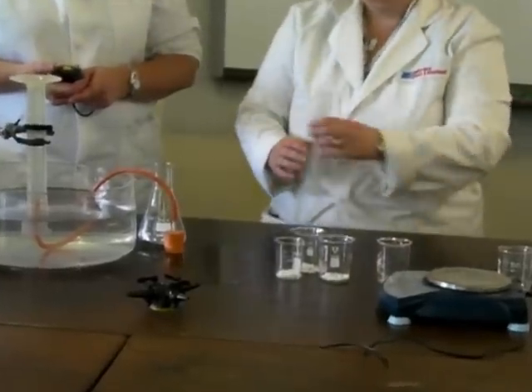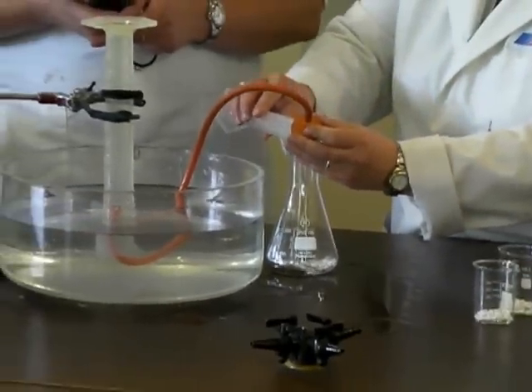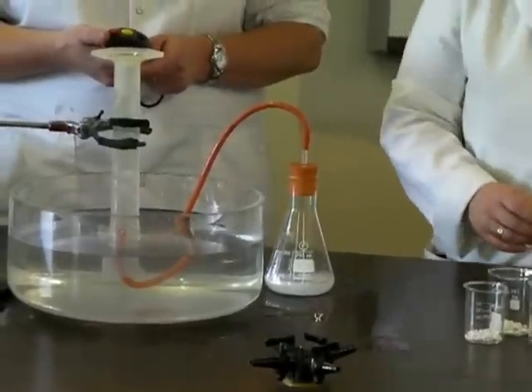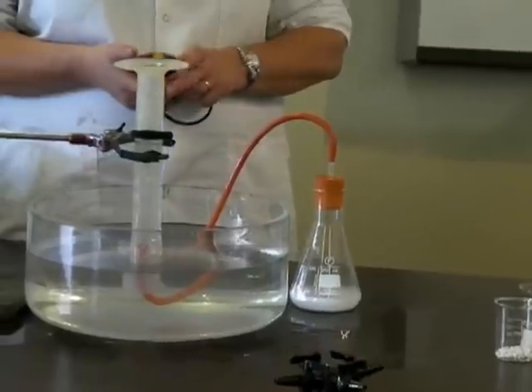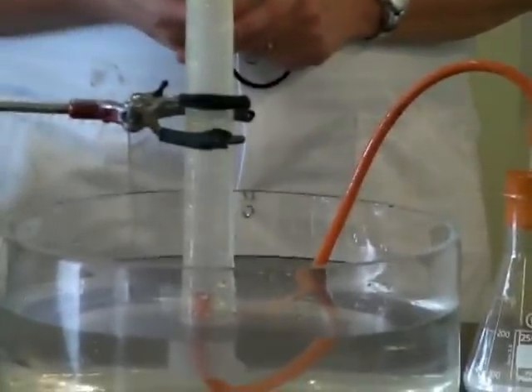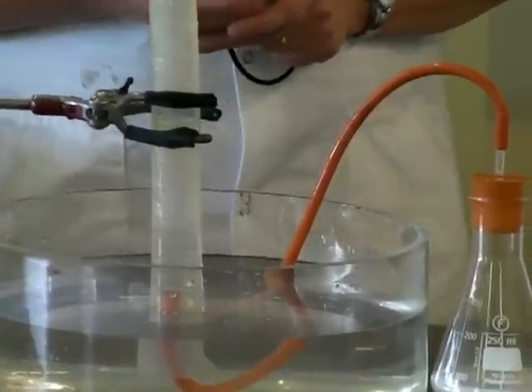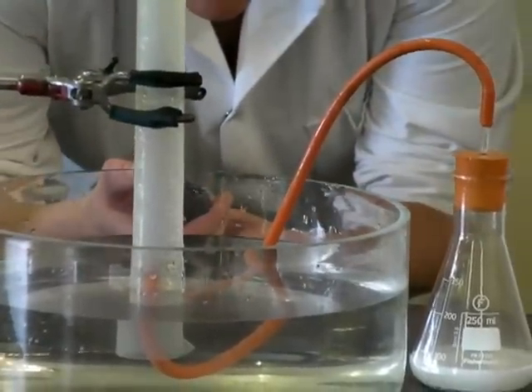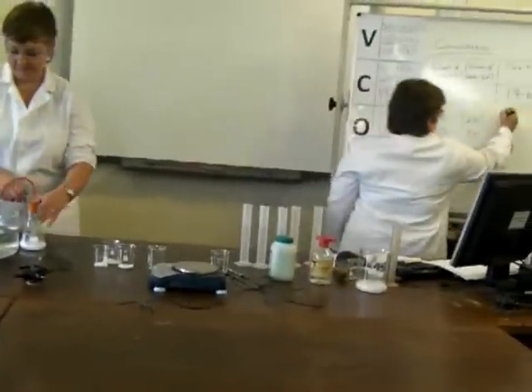Again, it's a 2-person job. 3, 2, 1, go. Again, it's filling up nicely. Will it be quicker or slower than 17.64? Look, 20.27, Miss Ryan.